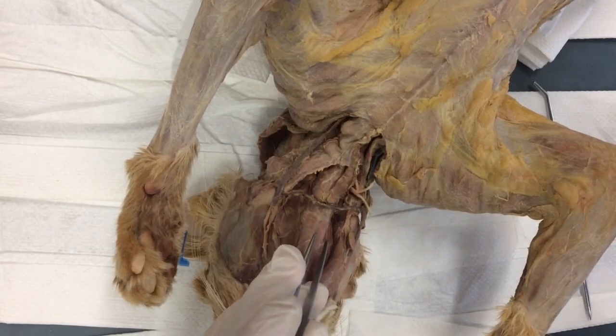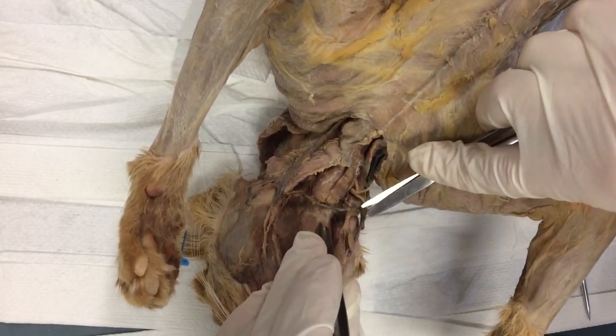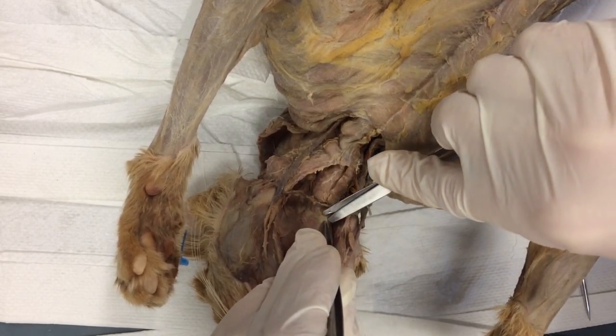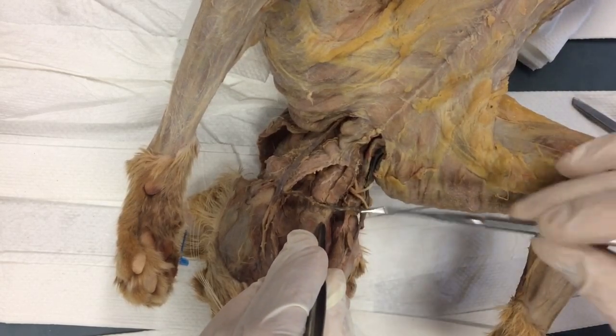So what I'm going to do with my scissors, we're going to baby nip, sharp side down. I normally would say that. So I'm going to grab right where the muscle tissue is and lift up until the little bag forms, and I'm going to put a hole in it, little baby hole. You should be able to see that on video right now, especially if you zoom in.